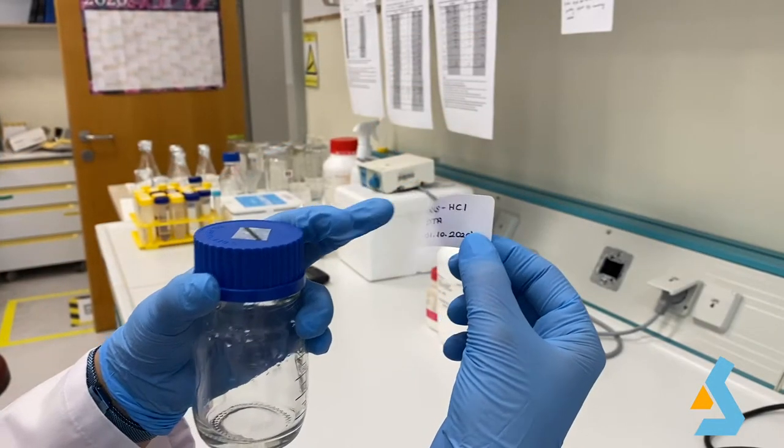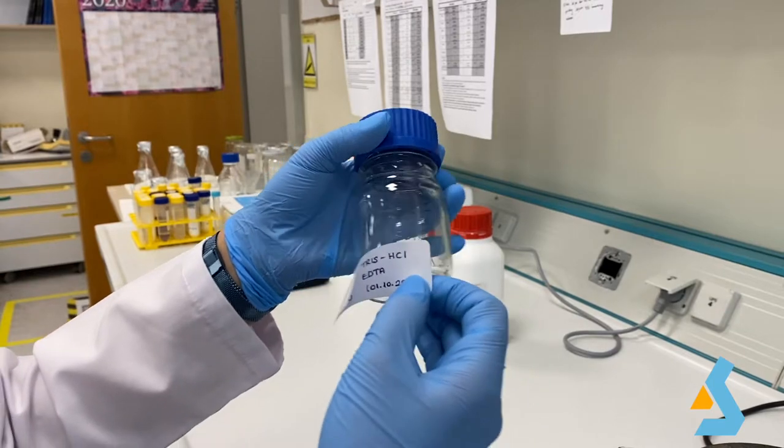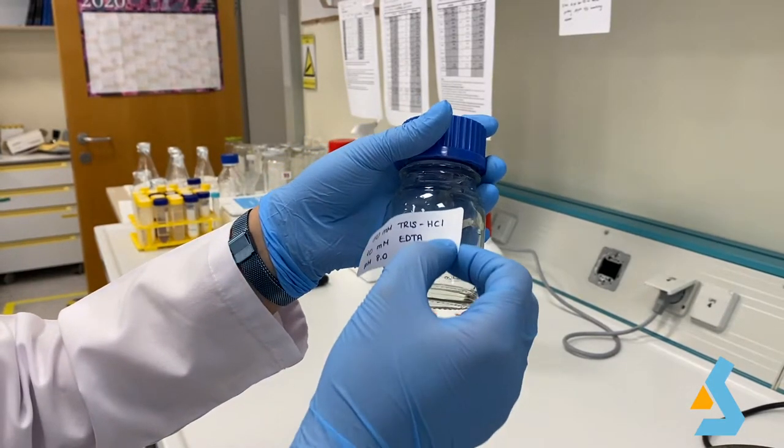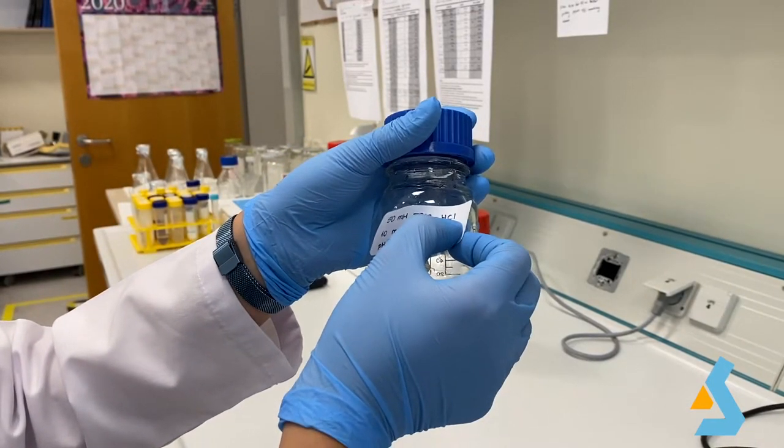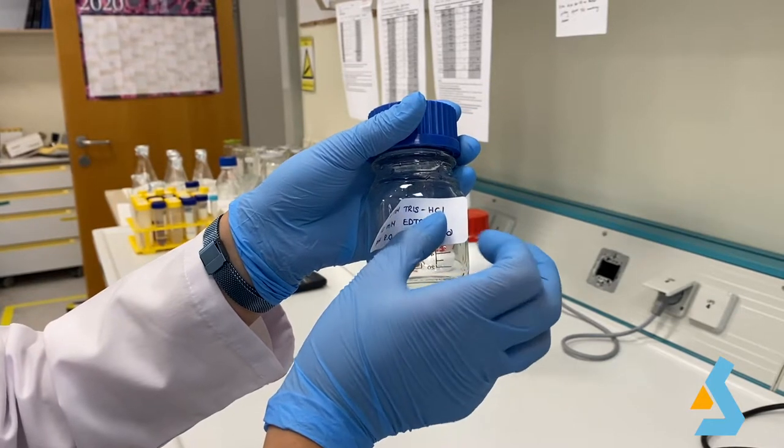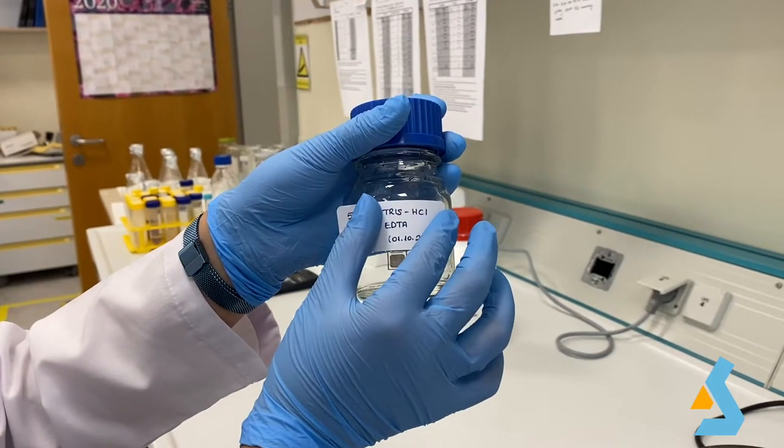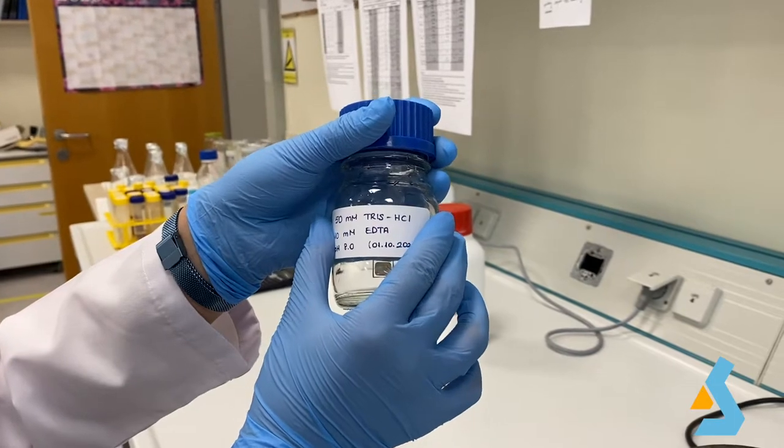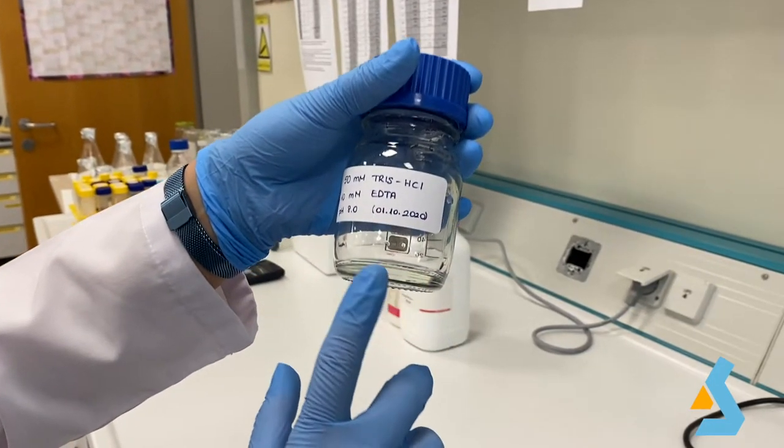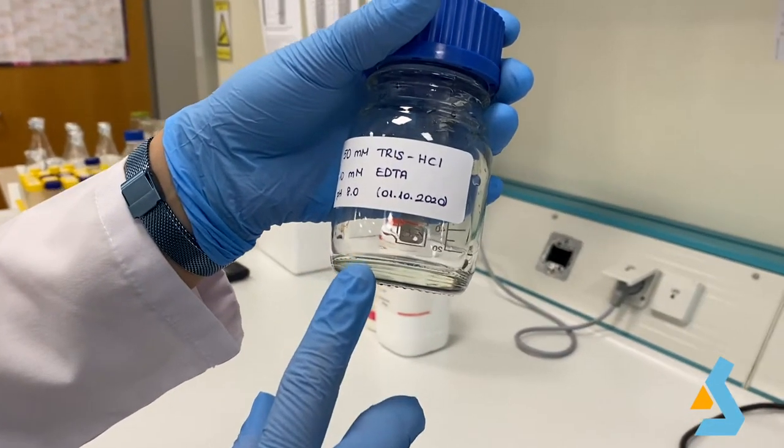For this video, we are going to prepare Tris EDTA TE buffer, which is a slightly basic solution with a pH of 8. It's a major constituent of DNA extraction buffer and it helps the lysis of cell wall and nuclear membrane. TE buffer is also a DNA preservative which stores DNA in intact form for a longer period of time without degrading it.